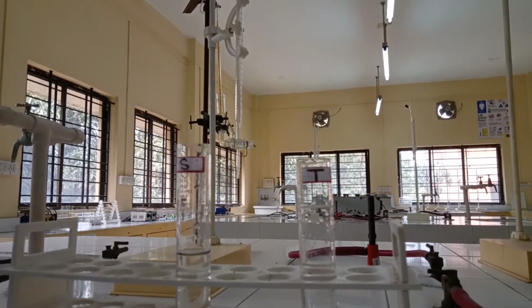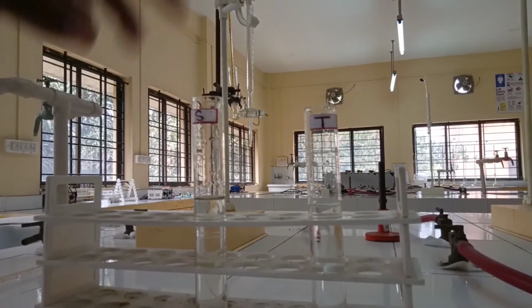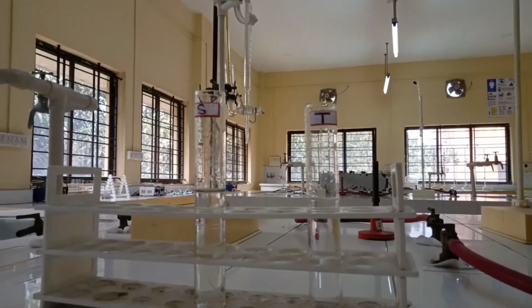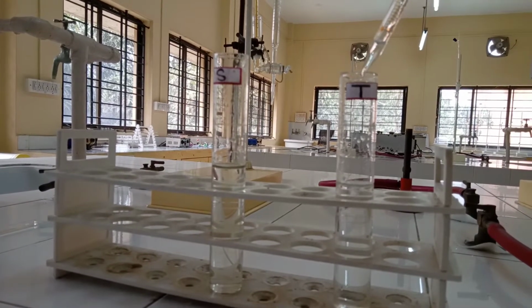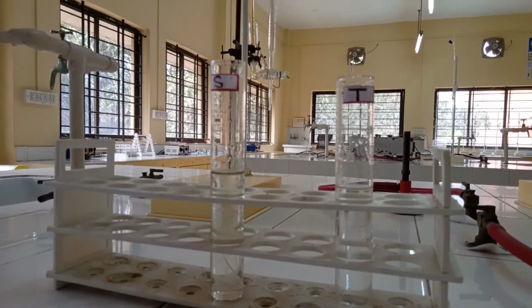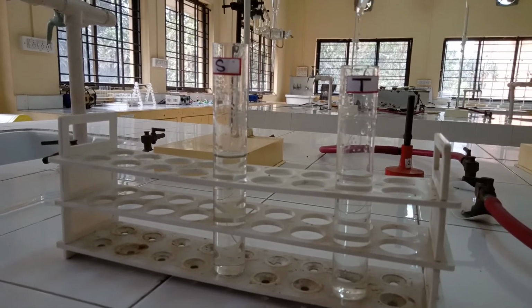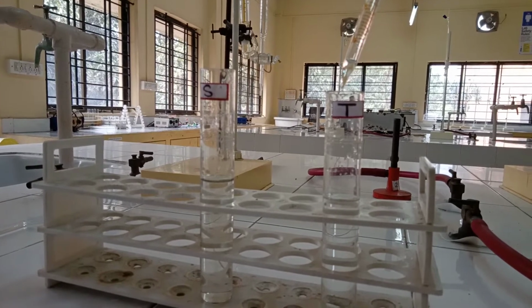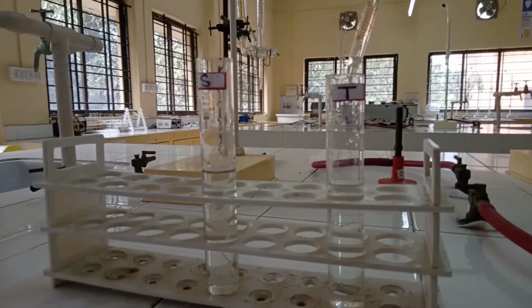and then we have to add 2 drops of thioglycolic acid to each of the Nessler's cylinders. We are adding 2 drops of thioglycolic acid to each of the Nessler's cylinders. After addition of thioglycolic acid to both the Nessler's cylinders, we are going to add few drops of ammonia solution to make the solution alkaline in both the Nessler's cylinders.